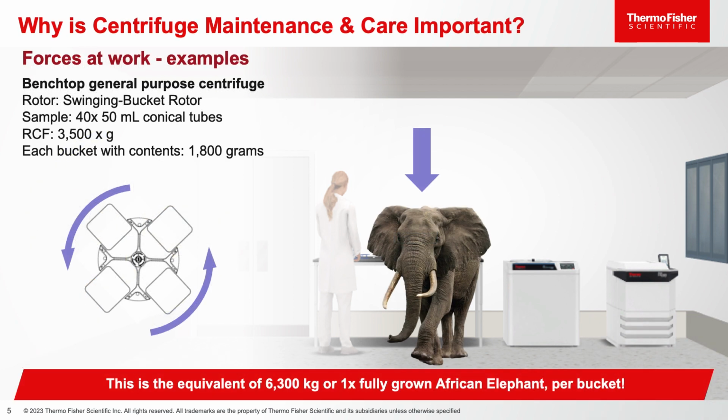So let's take a common example used in a lot of R&D labs, a general purpose benchtop centrifuge. In this centrifuge type, a researcher would typically use a swinging bucket rotor to run 50 mL conical tubes, let's say 40 of them. And then let's say the G force applied in the run is around 3,500 times G with 1,800 grams of content in each of the 4 buckets. So the question is, what forces are at work here? To put it in relative terms, the force applied to each bucket is equivalent to 6,300 kilograms, or the same as a fully grown African elephant per bucket.